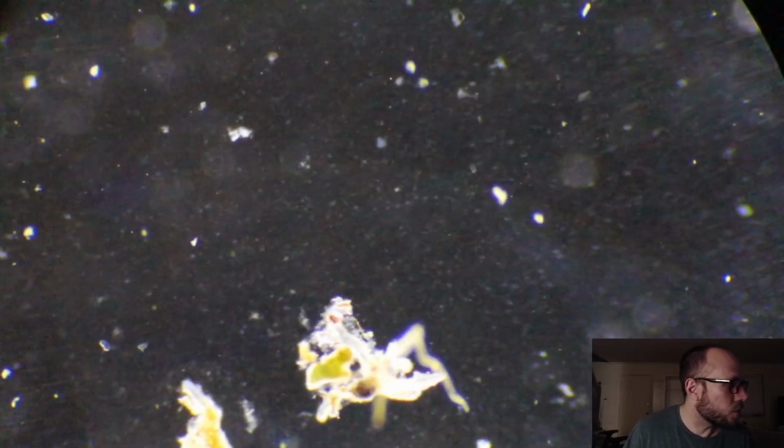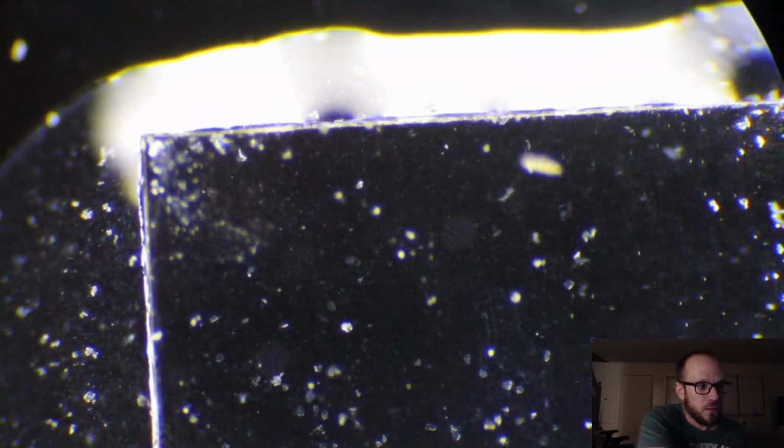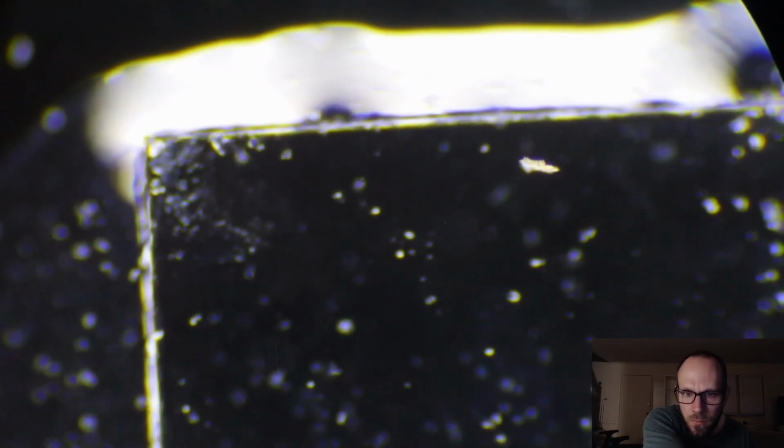I'm going to switch slides. This one's starting to bore me. Careful, Ken. All right, now, this slide was taken from the bottom of the microscope. So I suspect all of the stuff that lives towards the bottom and just flows there is going to show up and say hi. All right, we're at 40x. I'd like to go to the edge of the slide and just work my way in. All right, cool. Let's attain some focus here. What's that thing? Just garbage.